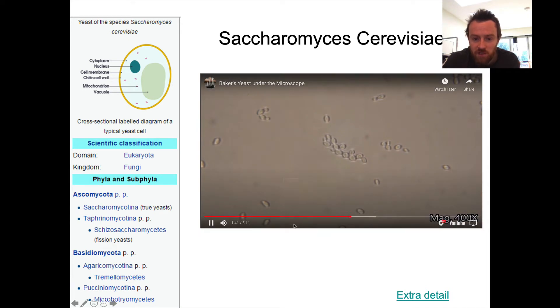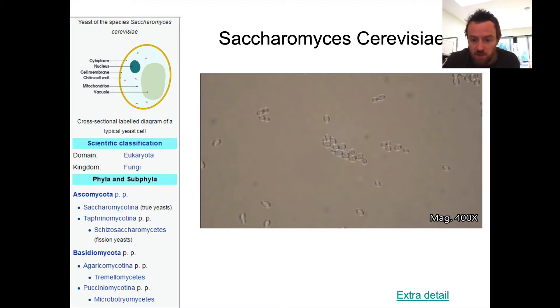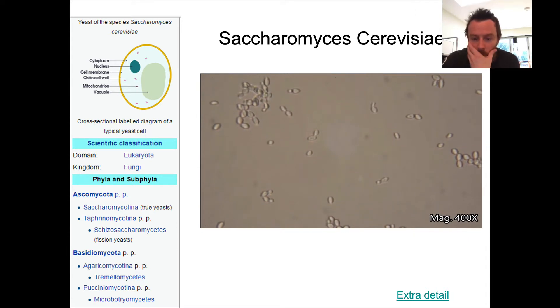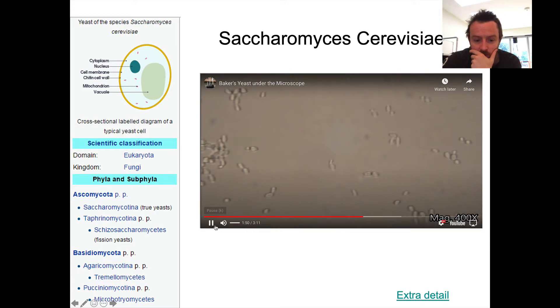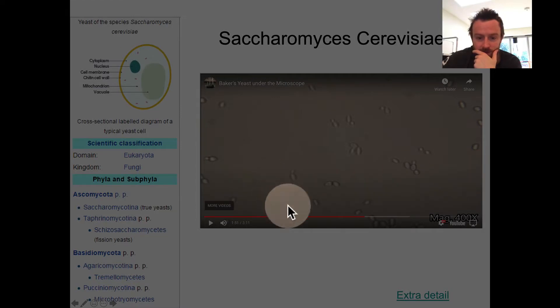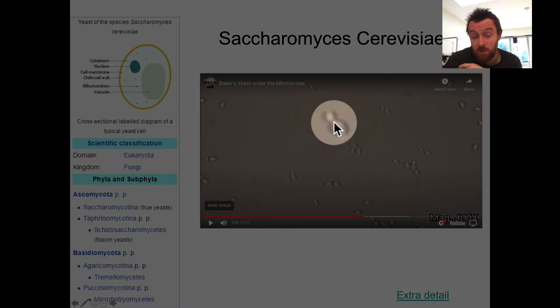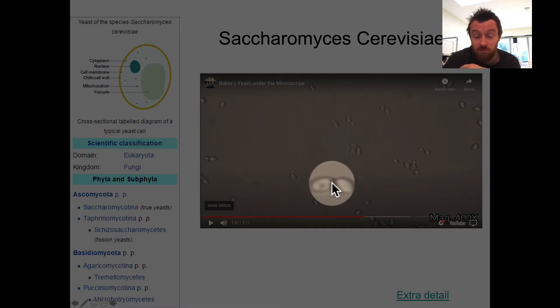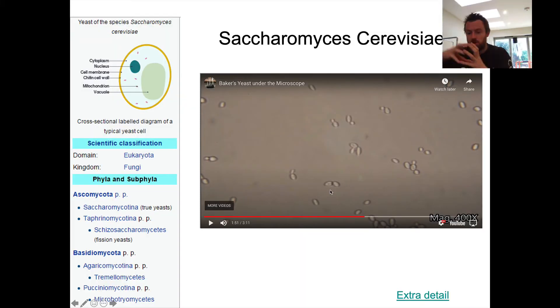Here we're at 400 times magnification, and what we can see here is the cells dividing by a process called budding. I'm trying to see if we can spot one — there's a good one. Here's one which is budding, and here's another one as well. So the larger adult cell is there and then it produces a smaller daughter cell right there, that grows off via a process called budding.